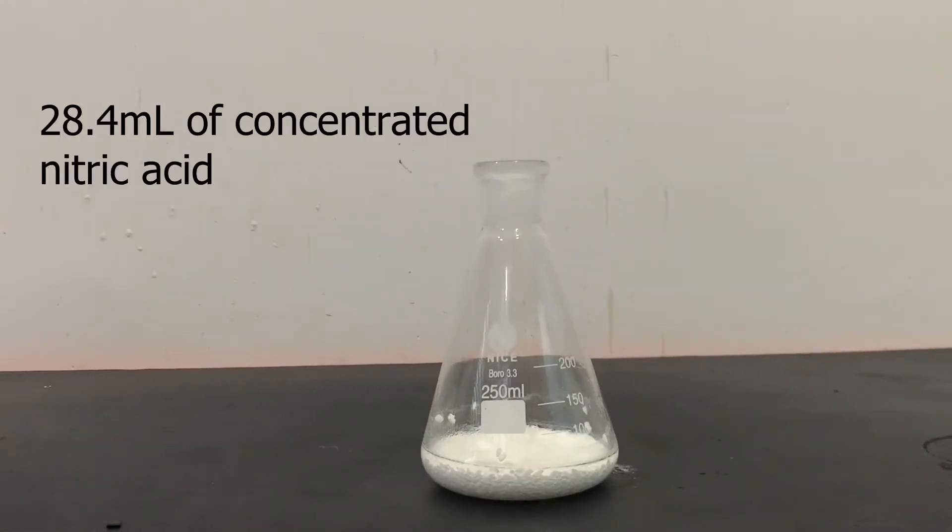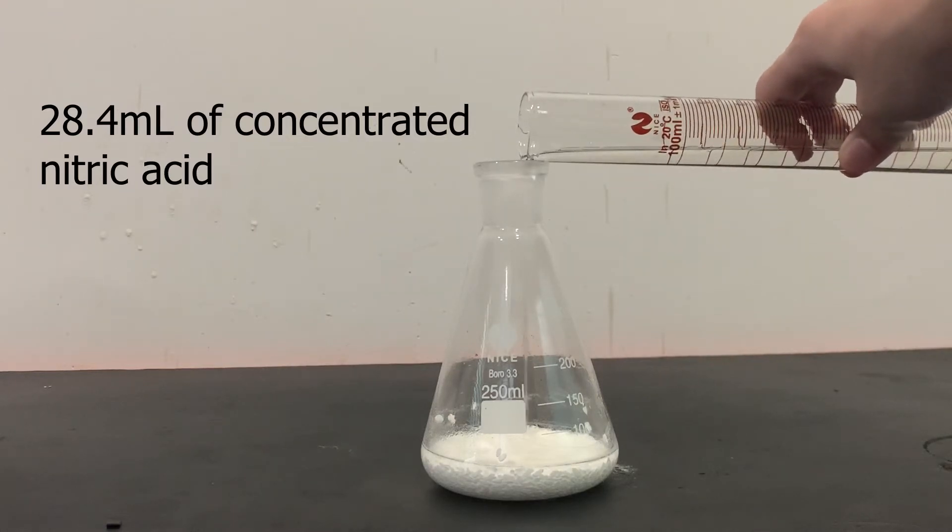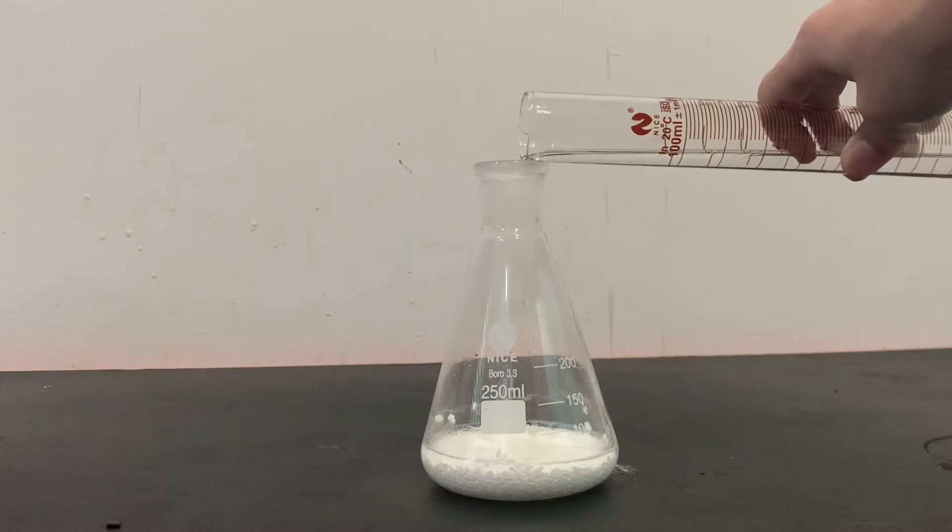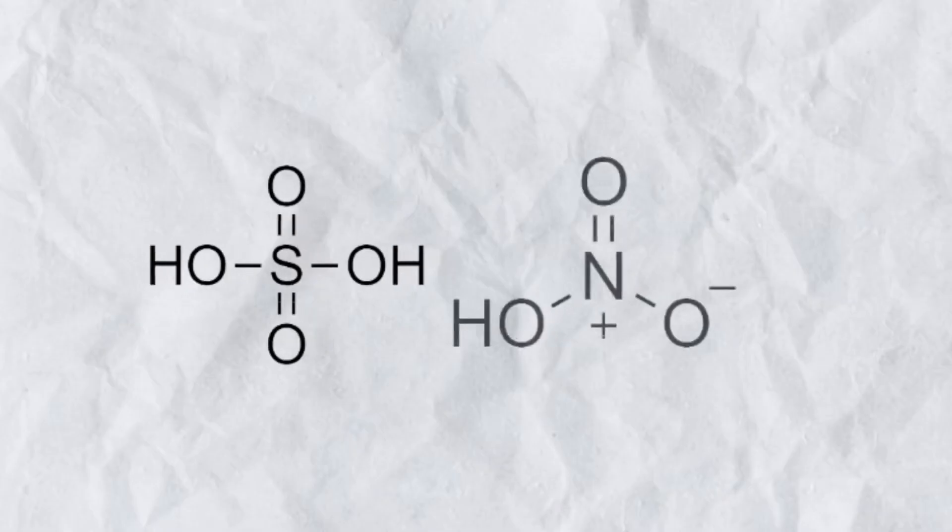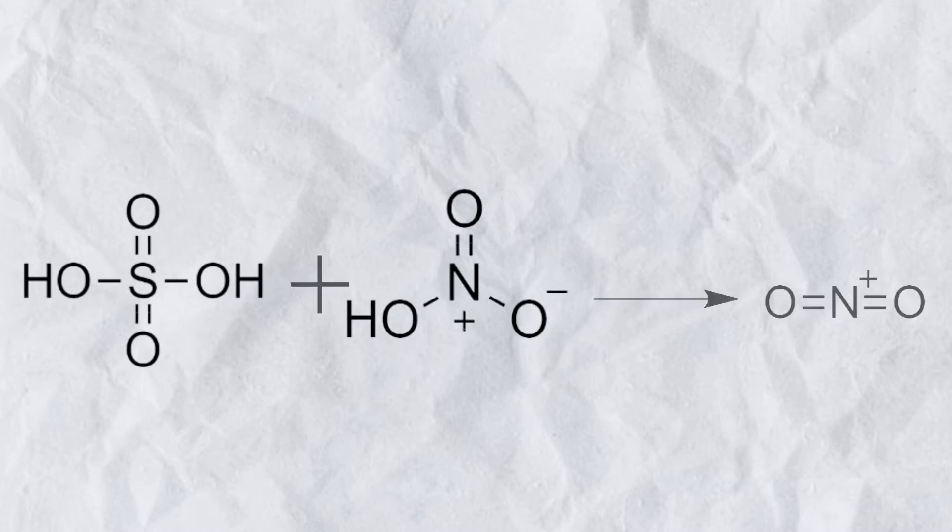Once all the sulfuric acid is added, I will begin to slowly add the 28.4 milliliters of concentrated nitric acid. As the nitric acid is added to the sulfuric acid, nitric acid accepts a proton from the sulfuric acid and forms the nitronium ion.